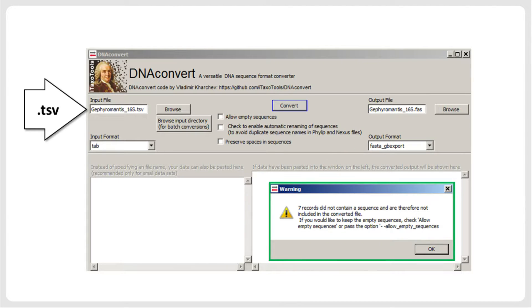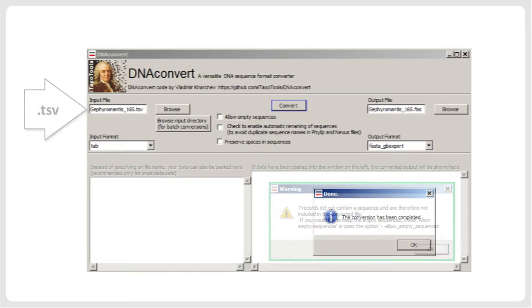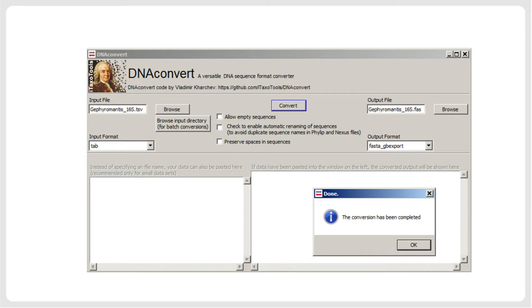dnaconvert has been programmed to be robust against minor user mistakes. For example, if some columns do not contain sequences, a specific warning is issued, but the program proceeds with the conversion. The program also issues a warning if some sequences are shorter than 200 base pairs, which is the minimum length required for GenBank submission.